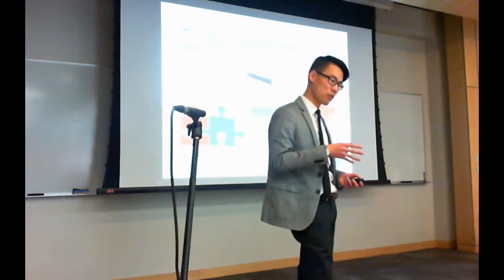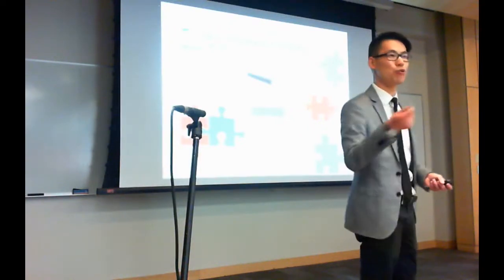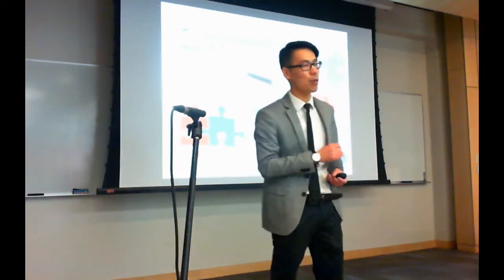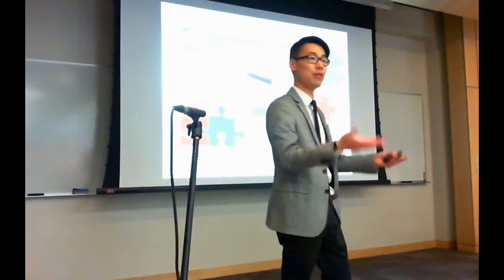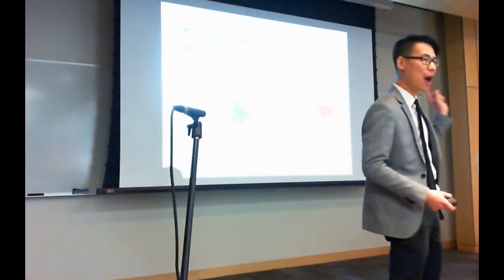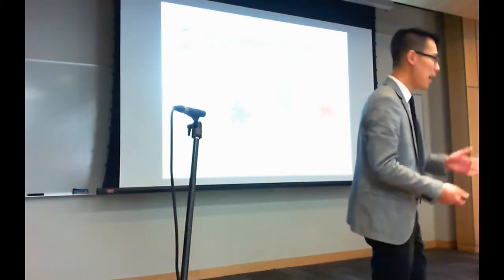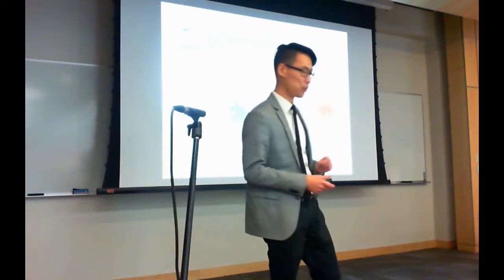To start getting at the structure, we can break it up. Some of the bonds in these molecules are stronger and weaker than others, and what we call tandem mass spectrometry takes advantage of that. When we fragment these molecules, the weaker bonds will break first. Then once we break it up, we measure how much the pieces weigh and how much of each piece is actually there. This gives us a somewhat unique signature of that particular molecule.